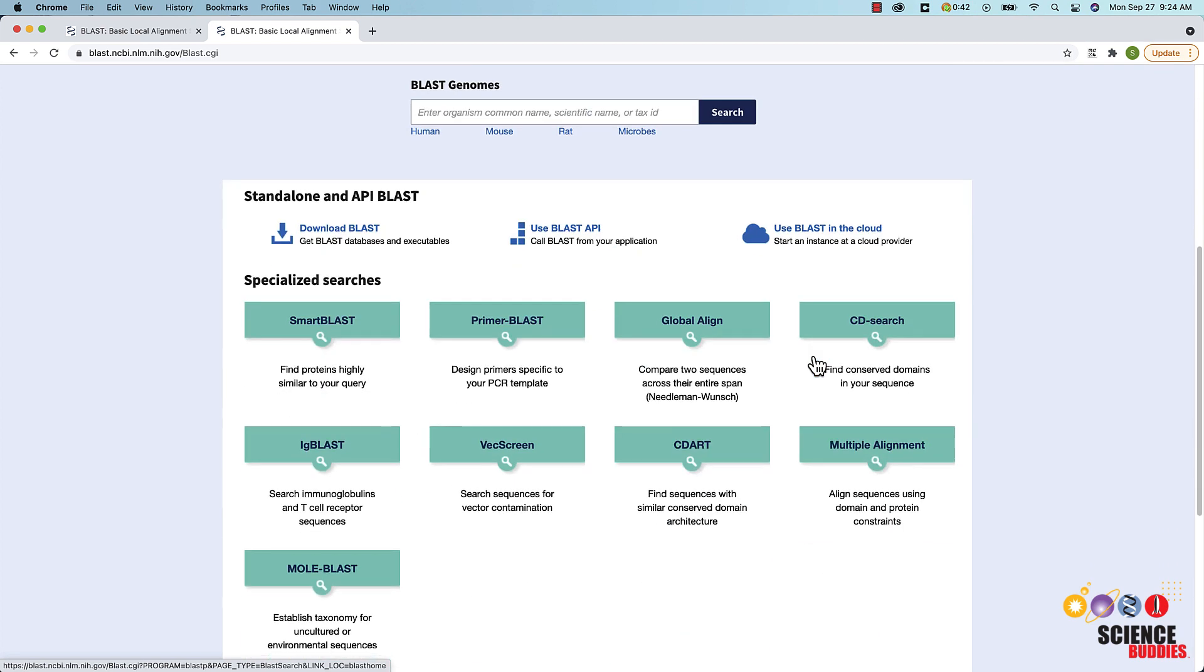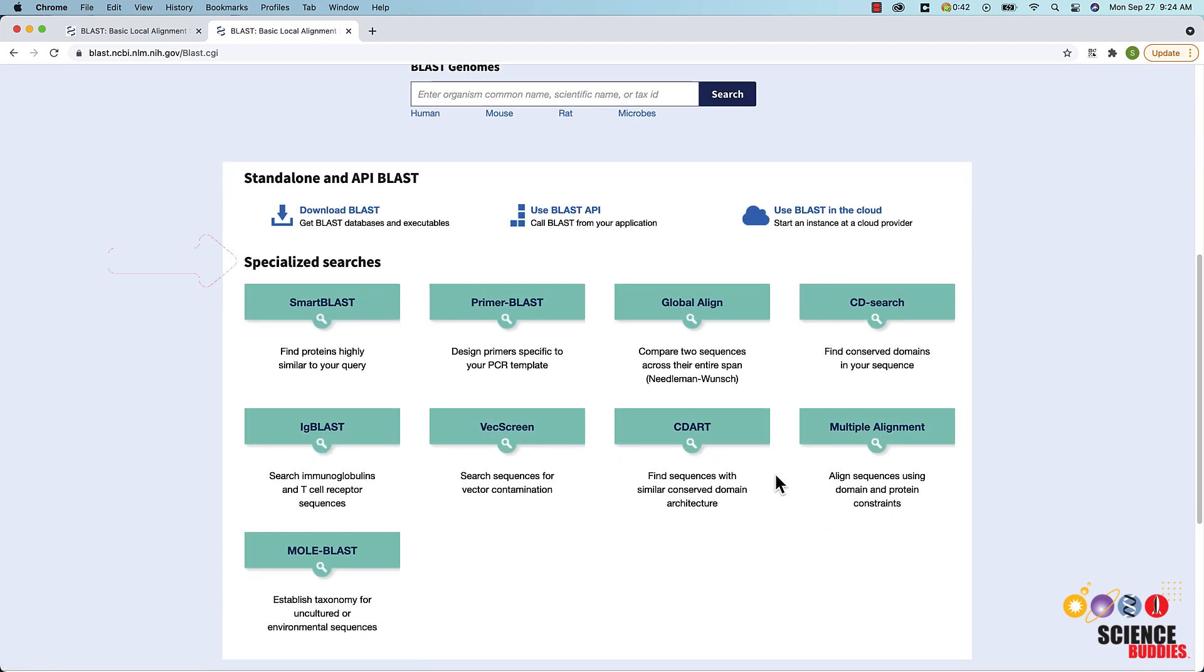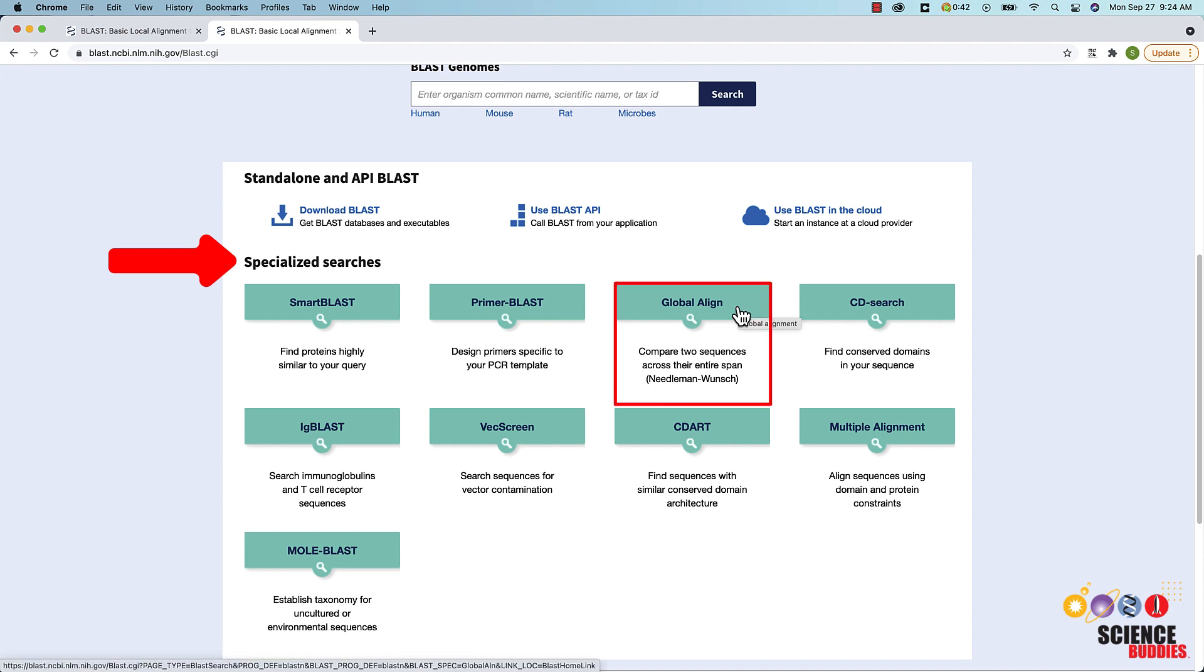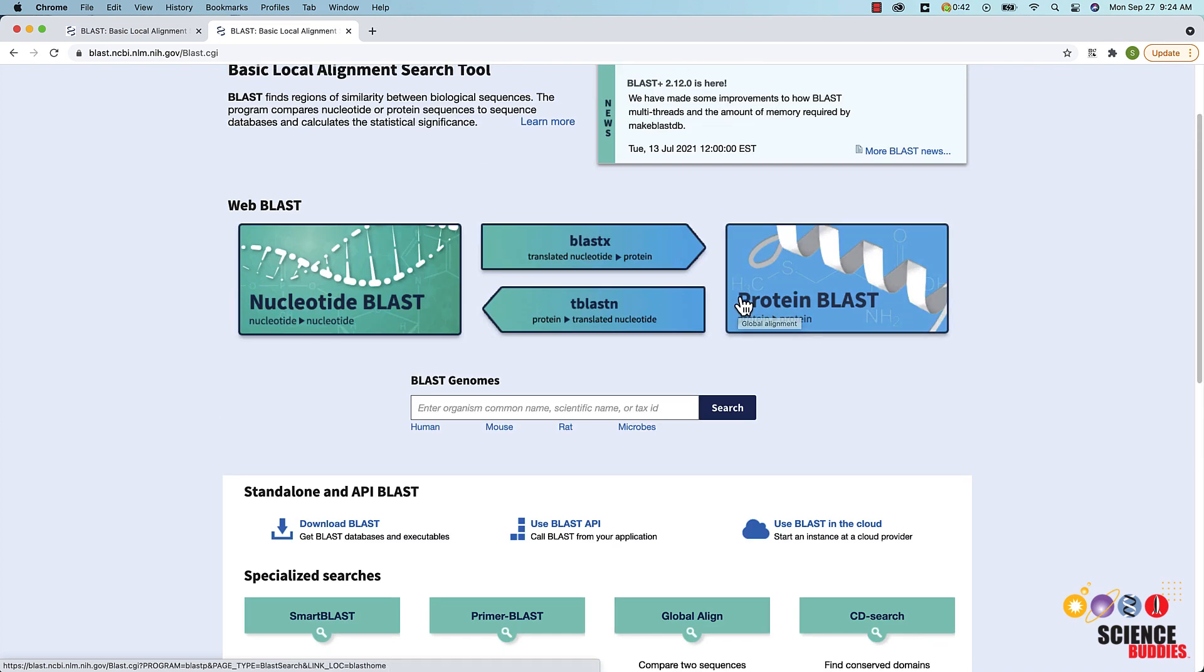Further down the page, you will find specialized searches such as the Global Align search which compares two sequences across their entire span. We will talk about this search function in more detail later in this video.